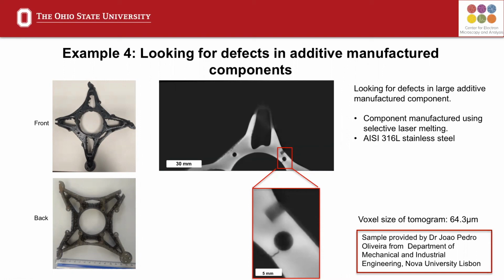From visual inspection of the tomogram, a slice of which you can see on the screen, we were able to clearly identify the flat bottom hole here. And this picture here is just zoomed in on this little red area. We were also able to identify this little crack. So this scan really showed that for samples of this geometry and density, we are able to use the HeliScan to detect defects of the size of this flat bottom hole. And I believe the flat bottom hole was about 4 millimeters in diameter.